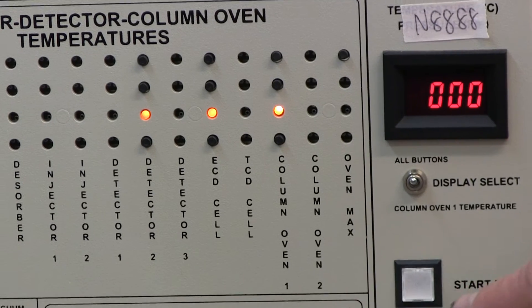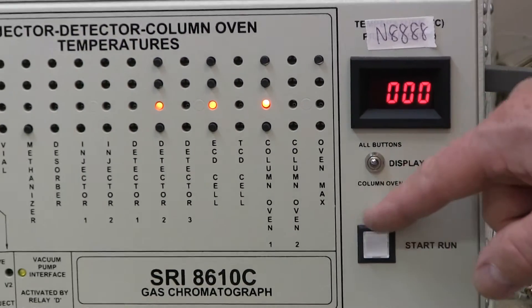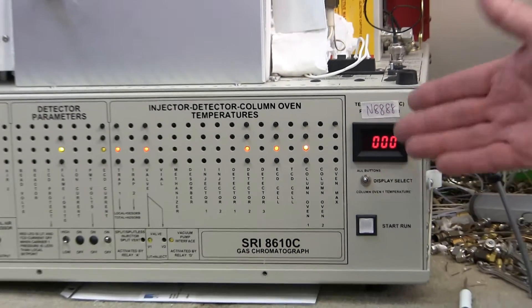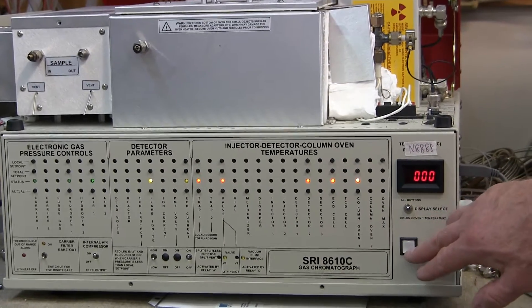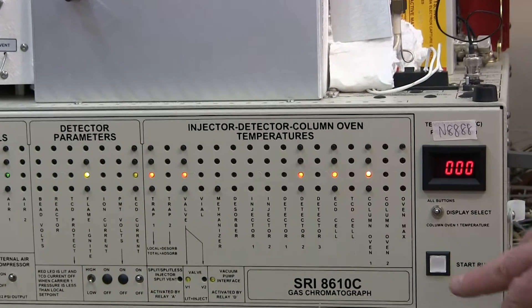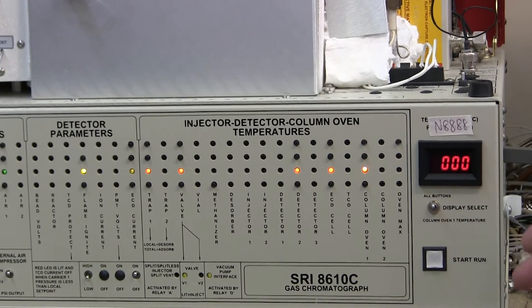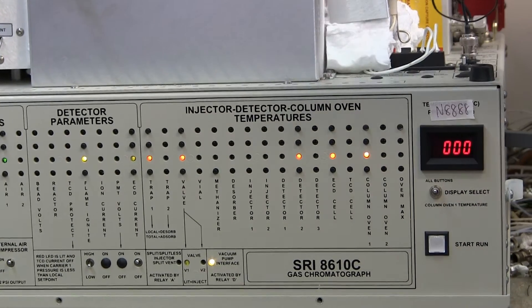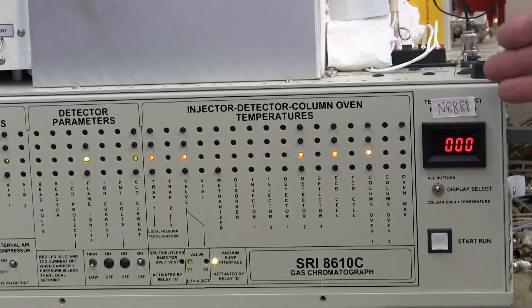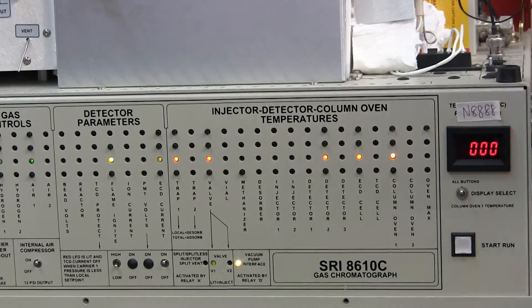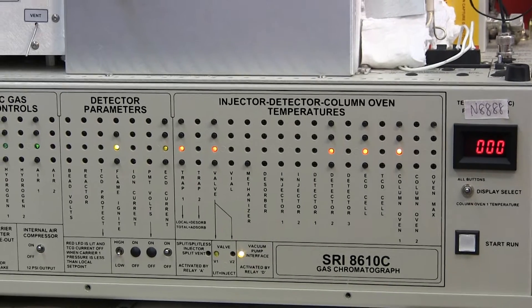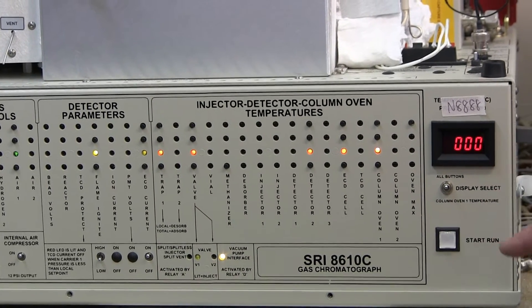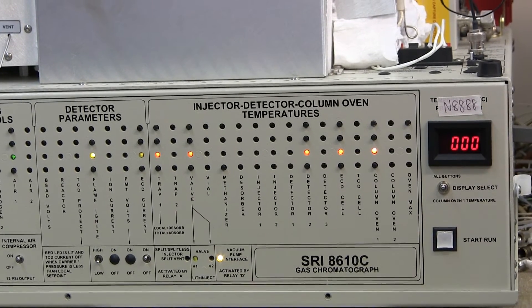Also on the front panel, there's a ready light. The ready light lights up once everything is equilibrated. You don't have to wait to start the analysis. You can start the analysis by pushing the start button any time, whether the light is lit or not. But when the light is lit, it means that the oven is at the set point temperature and has been for a minute without having any kind of excursion beyond one degree from the set point temperature.